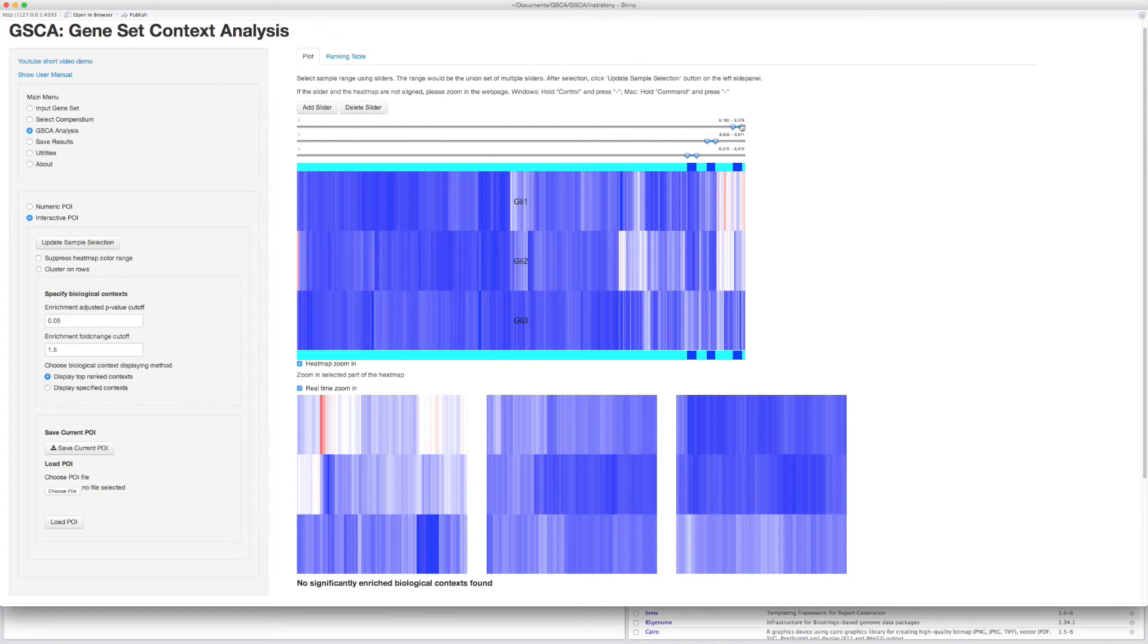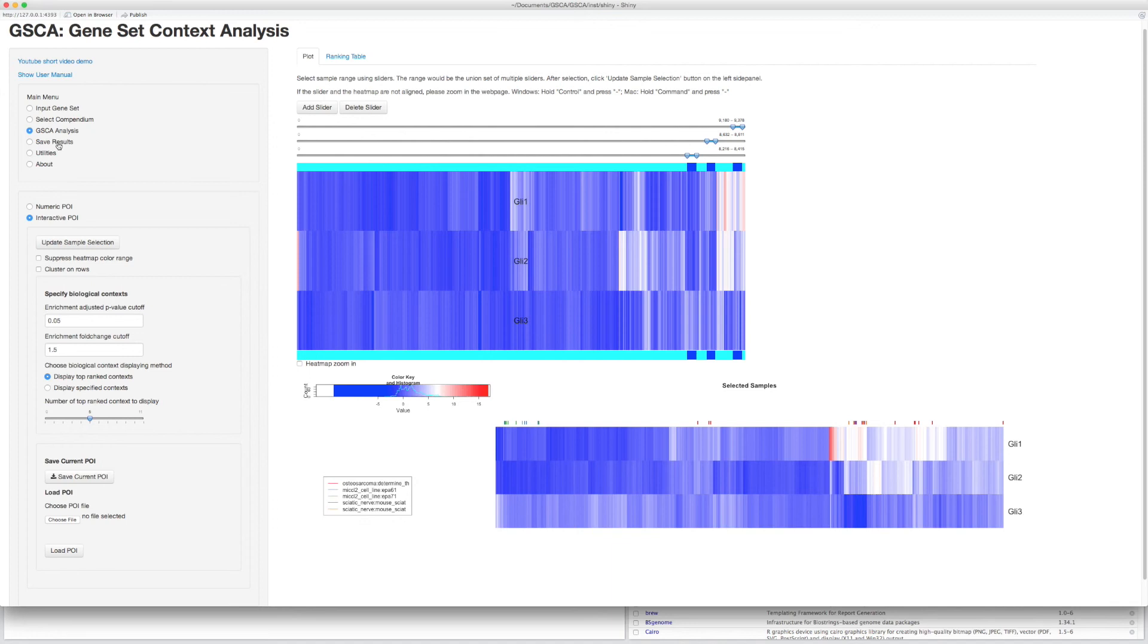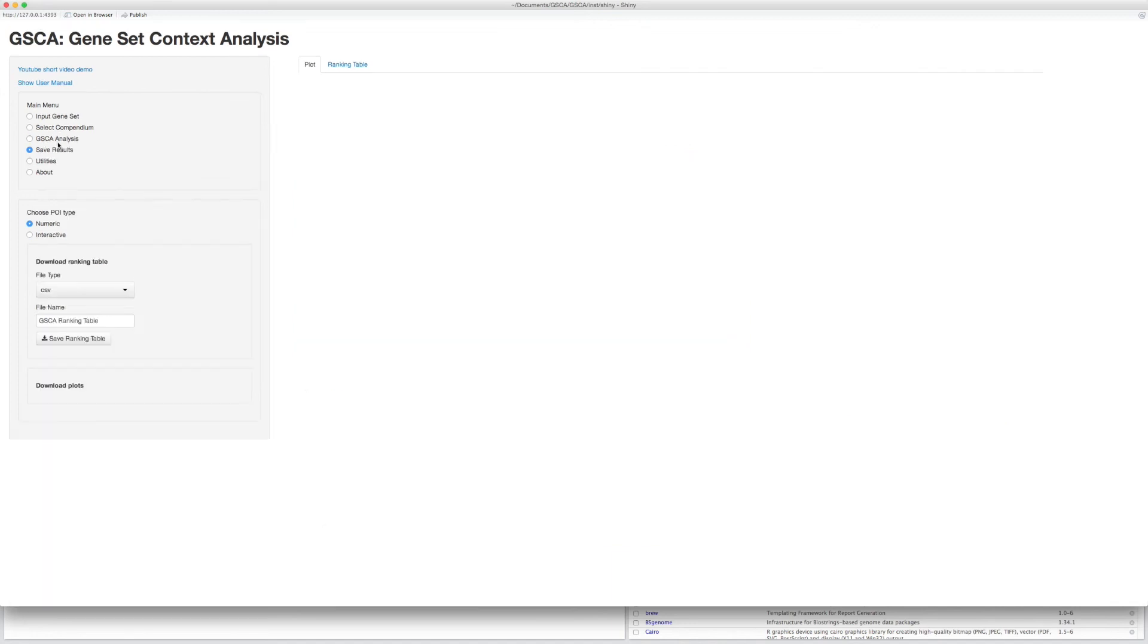If you have finished selection, click Update Sample Selection button. GSCA will identify all enriched biological contexts associated with the given POI. Now go to the Download Step to save the results.